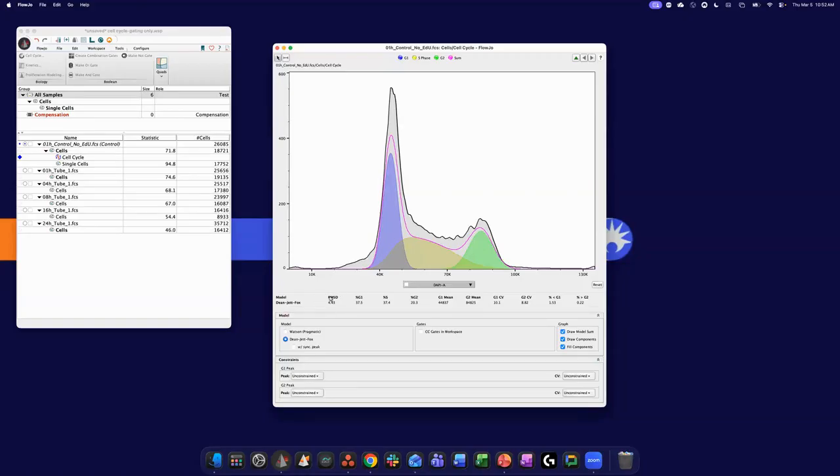That's basically how much the model deviates from your data. So comparing the gray to the pink, ideally they'd be completely the same, right? There'd be no deviation in a perfect world, but this is imperfect, so all you can hope for is the lowest value possible. With the Dean Jett Fox, I can see that the value went up to 4. When I had the Watson Pragmatic, it was 3.4. So I'd argue that the Watson Pragmatic is probably doing a better job.